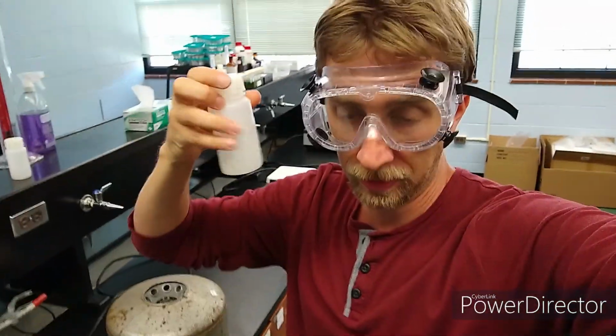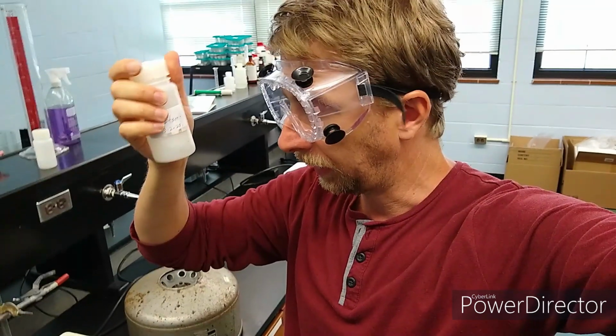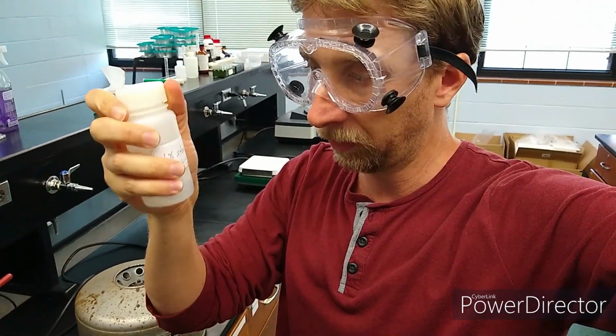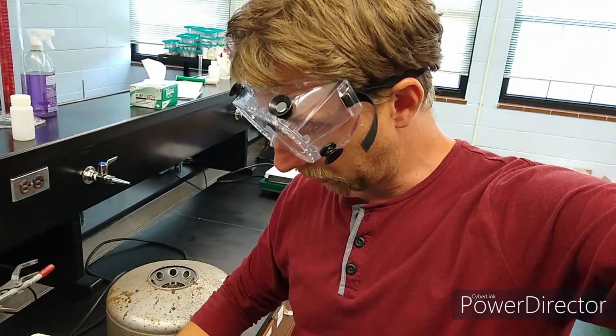The bad thing about that is starch doesn't stay good for very long. There's some type of fungus or something that likes to grow inside of starch solutions very easily. The label said it was made on the 2nd of last month, so it's a little over a month old. I'm going to look in here and see if I see any evidence of that fungus.